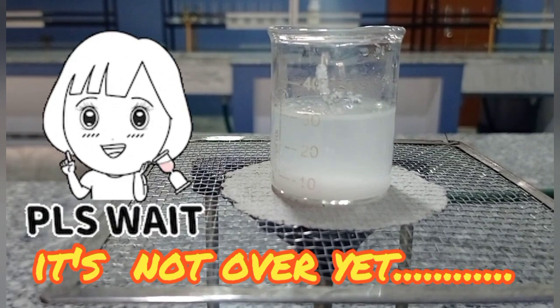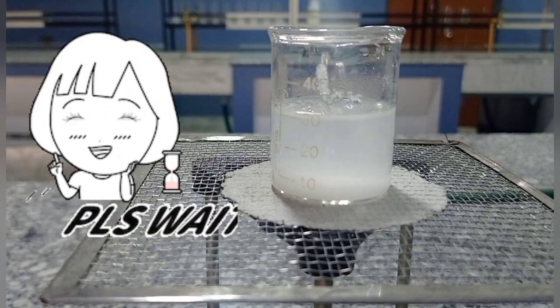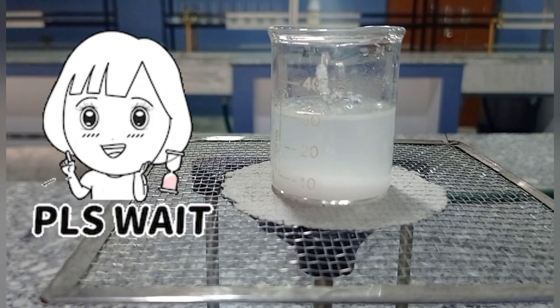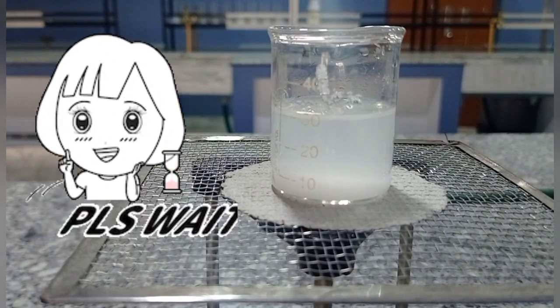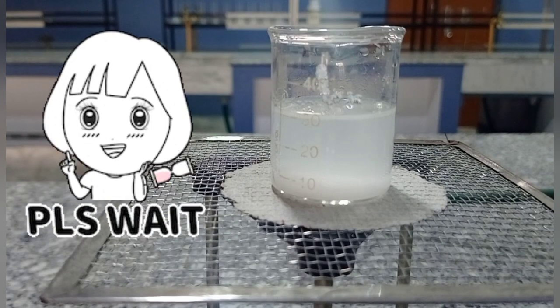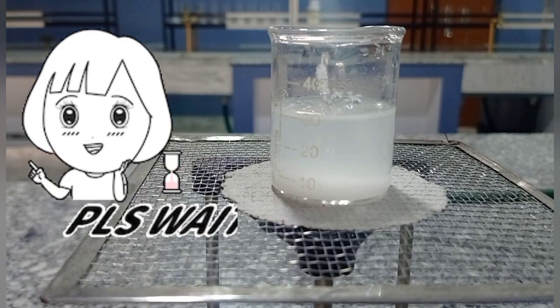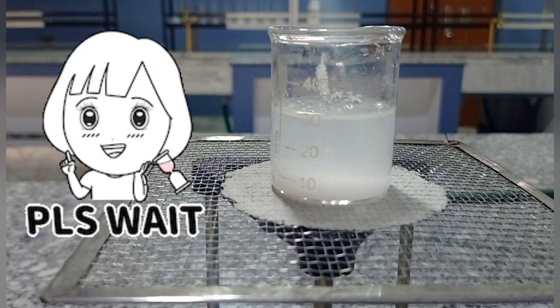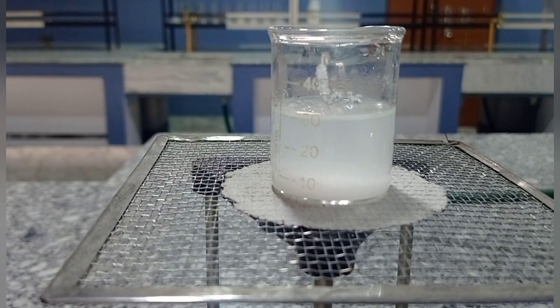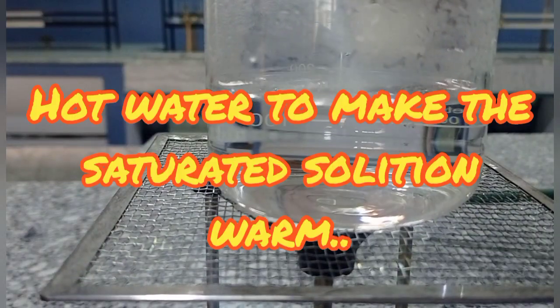My dear student, now I will require hot water and I will increase the temperature of this same solution, and then again we will check whether this salt is getting dissolved or not. So let's move on. For that I require hot water. This is hot water.